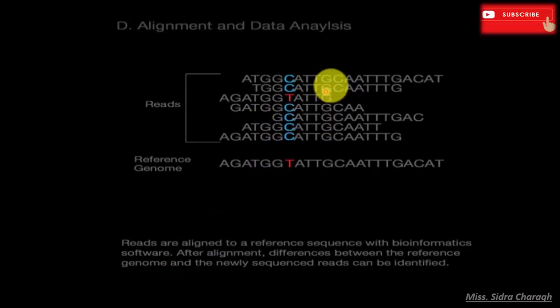Once the scientists are able to visualize the various DNA sequences, they are sequentially aligned using a reference genome. A reference genome is a human-made DNA sequence that represents a specific species' set of genes, and this phase can only be done using advanced bioinformatic programs. These programs help to distinguish any variation between the aligned reads and the reference DNA sequence.